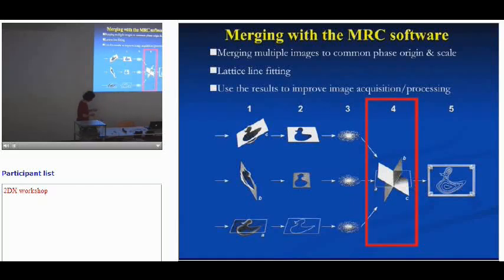So the part I want to cover in terms of the whole process of getting 3D reconstruction is the part that, once you have several images, images of different tilts, you can put them together before you sample it and it reconstructs the 3D images. There are three parts to it.